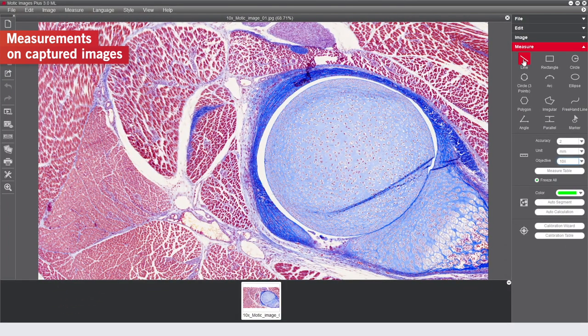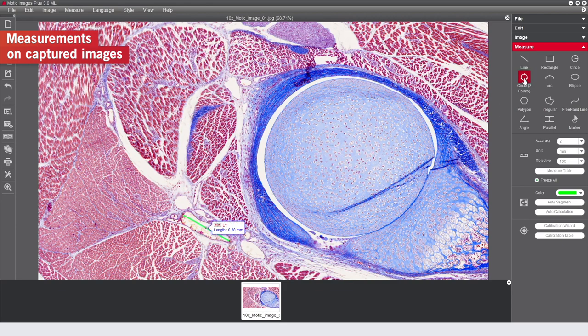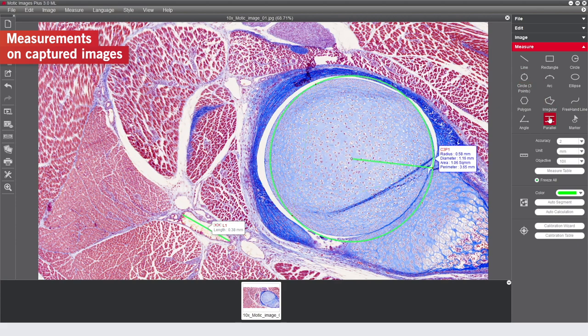Now, on measure menu, you can select several options, like line, circle, parallel lines, etc.